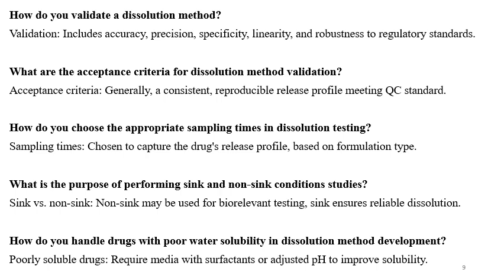How do you validate a dissolution method? So validation includes validating the accuracy, precision, specificity, linearity and robustness for regulatory standards and compliance. What are the acceptance criteria for dissolution method validation? So generally a consistent reproducible release profile meeting the QC standard is the criteria.